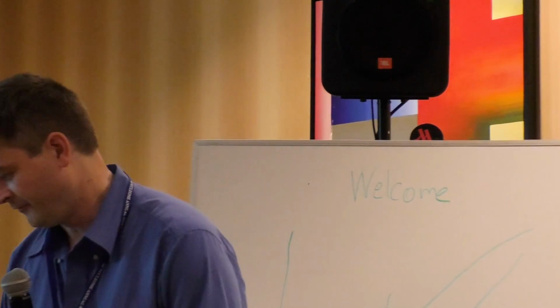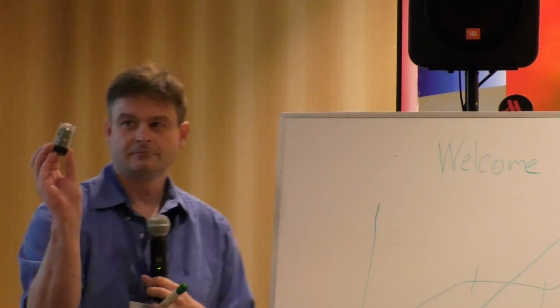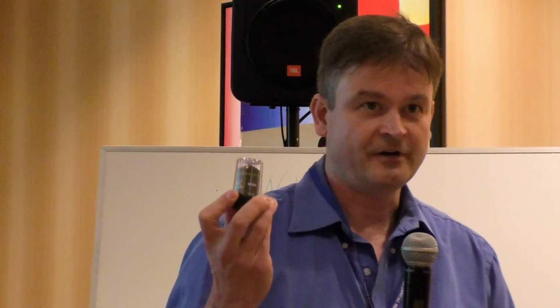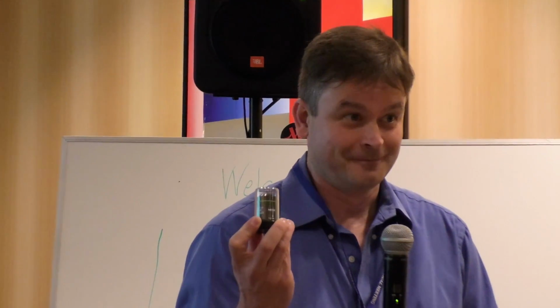Now, just as a little side comment, if I have an objective from a certain company, let's take Olympus 20X or Olympus 60X or whatever. This thing has a specified function, right? It's a piece of engineering. It should do something to a certain degree. And we assume that the labels on there tell us something about it. There's a magnification, there's a field number, there's a numerical aperture. Okay. There's also an expectation of how good the optic is.